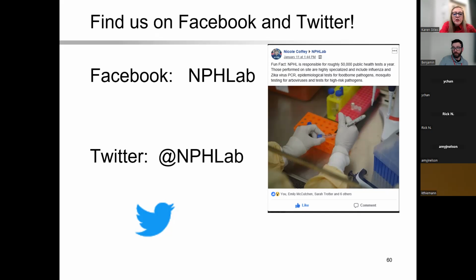This is where you're going to get a really good idea of how your employees are doing and how well they're reading. Another way to do it is to go through those gram stain reports, as Ben noted earlier, that a supervisor or a manager will review.